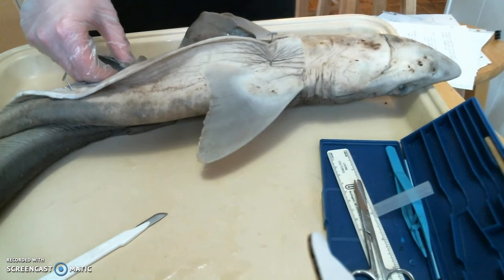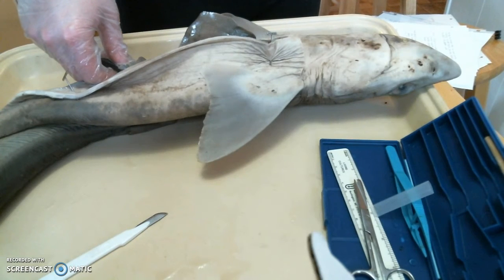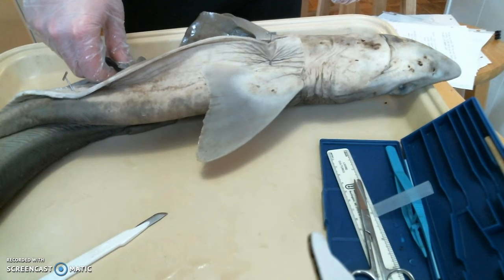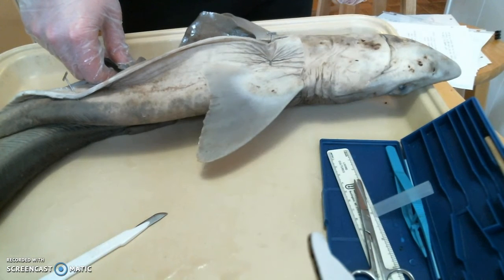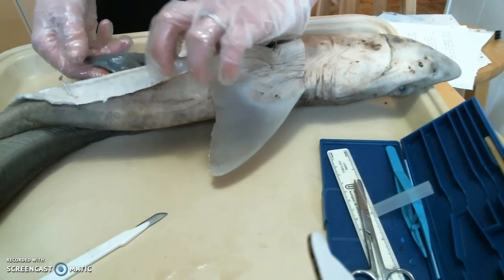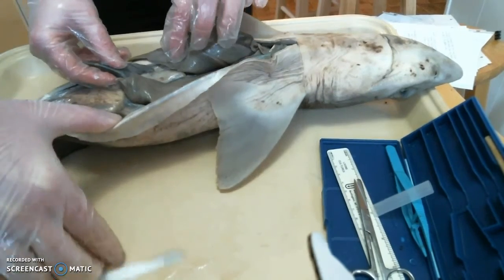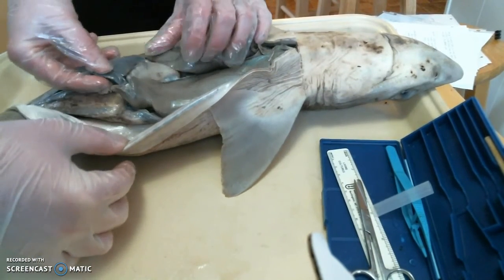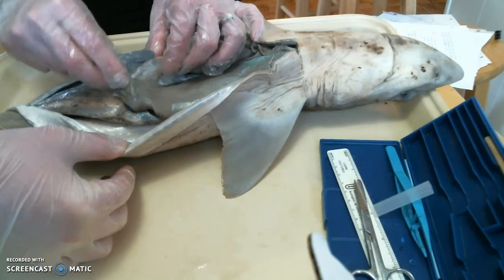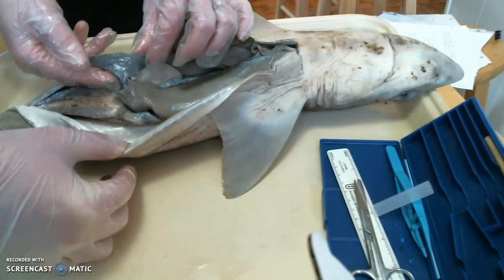It says, wash off the stomach, notice the inner lining folds help to mix and churn the food with digestive juices. And then they said if you locate the end of the stomach, you'll see the rectal gland. That's what I'm guessing maybe that this is. There's an almost triangular dark black piece that I'm trying to figure out if that could be, oh no, that's the spleen. Okay. So I'm not sure which one is the rectal gland, but it does say dark triangular shaped is the spleen. So we'll have the spleen there. That's pretty easy to find.